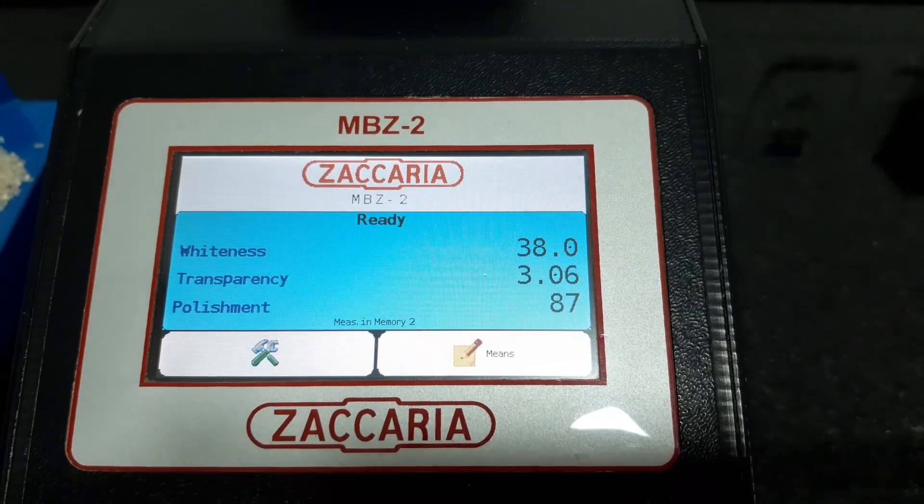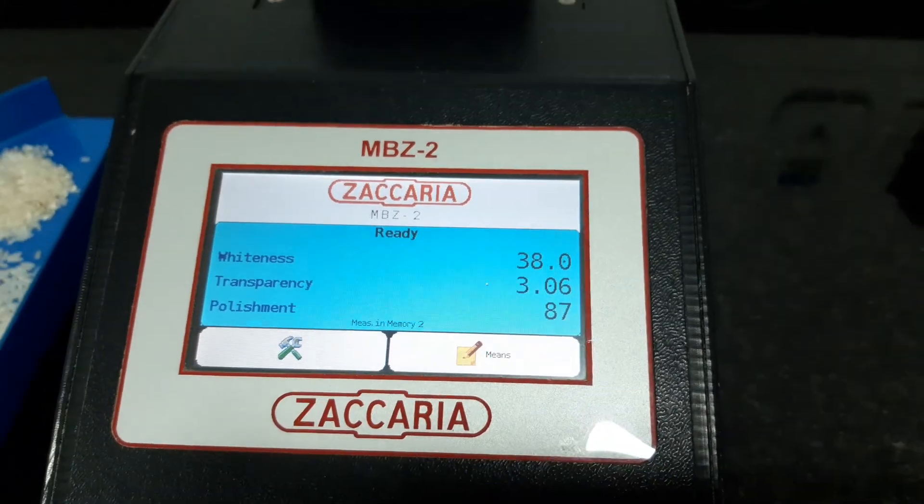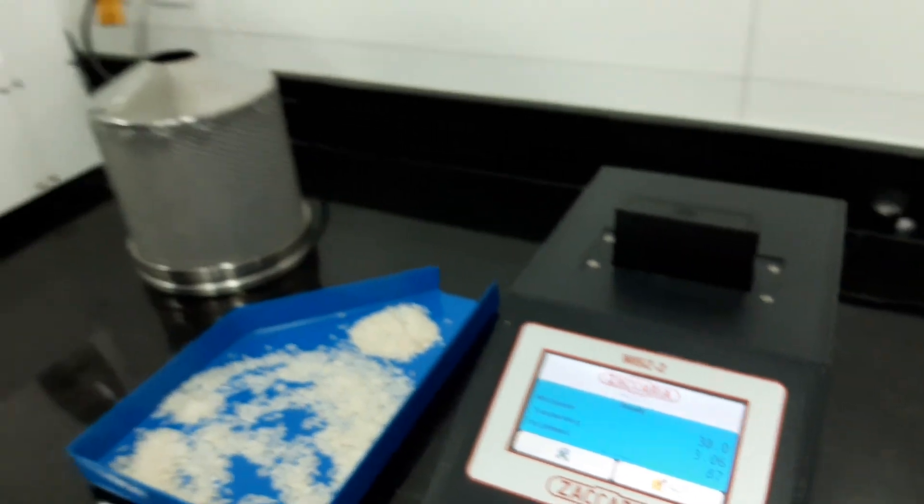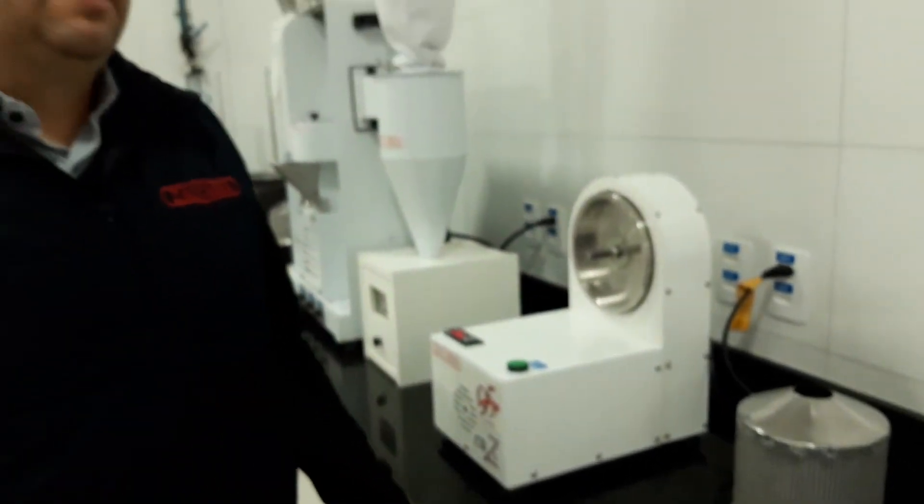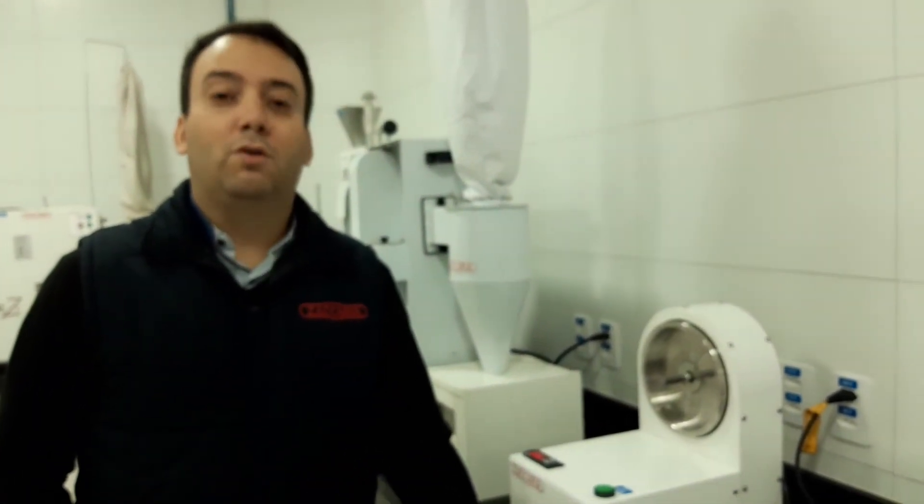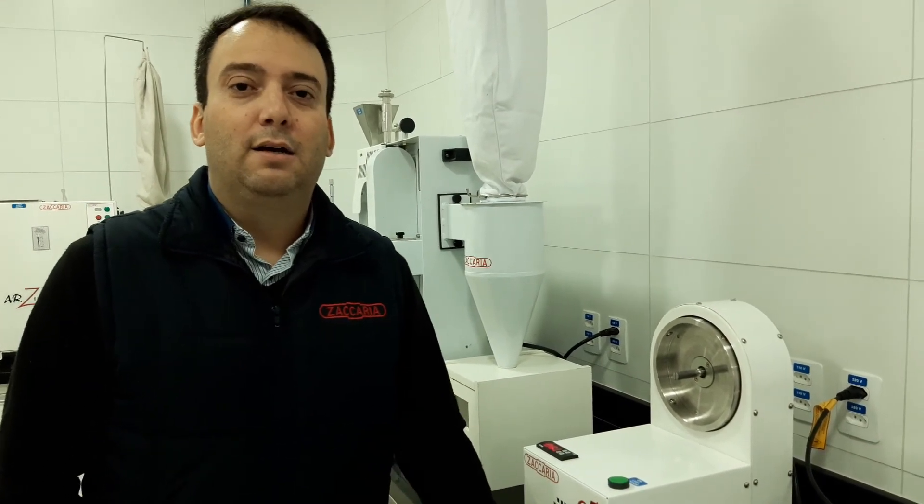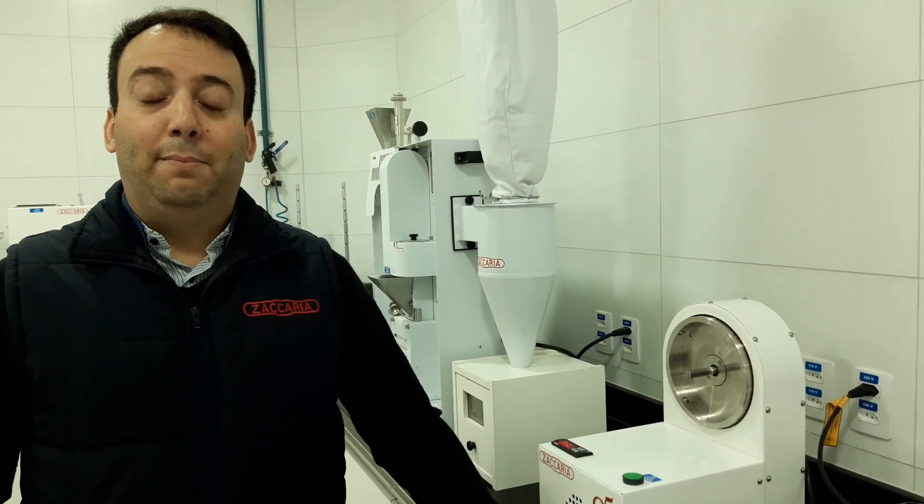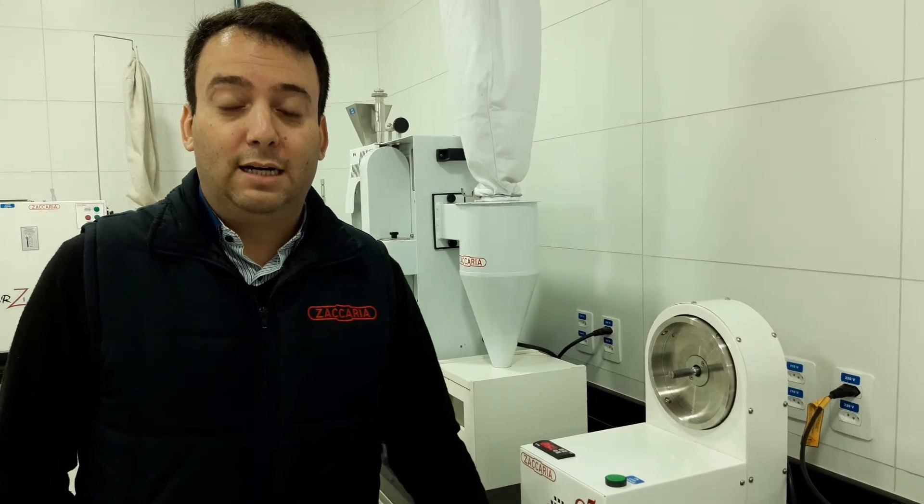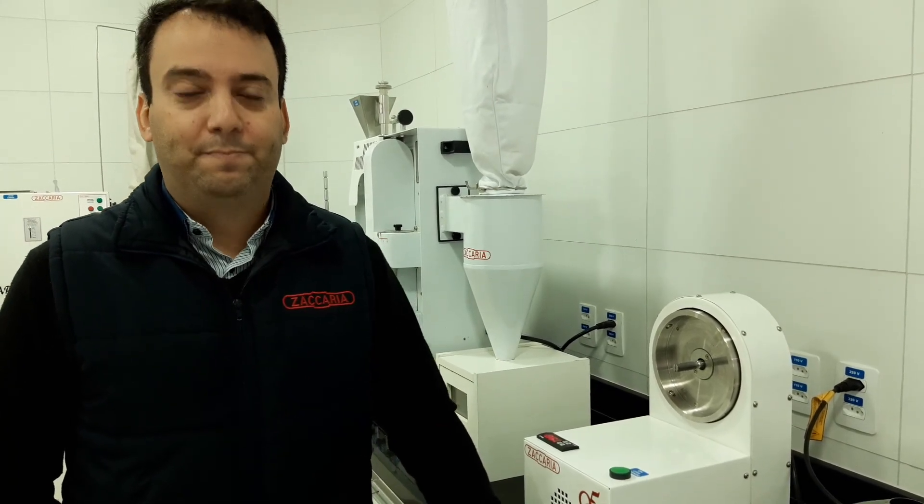And now we finish the sample, the lab sample, from the paddy until the white rice. So for more information, you can visit our website at www.zacaria.com.br.